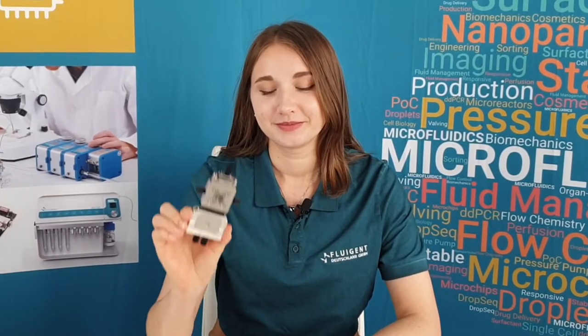Hi, it's Lisa from Fluigent. Today I will present our simple technique for double emulsion with a ray drop. Double emulsion has many applications. It has been quite a challenge until today, but it really doesn't have to be some kind of witchcraft, especially if you do it the right way with our double emulsion ray drop.